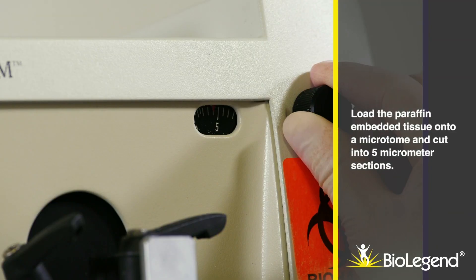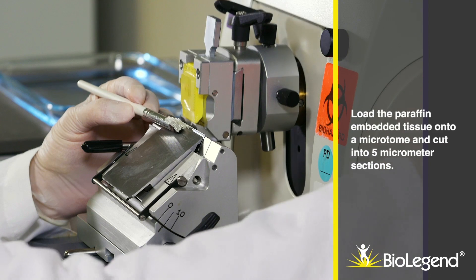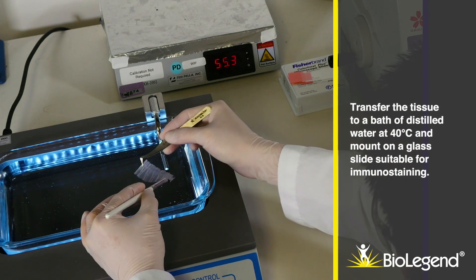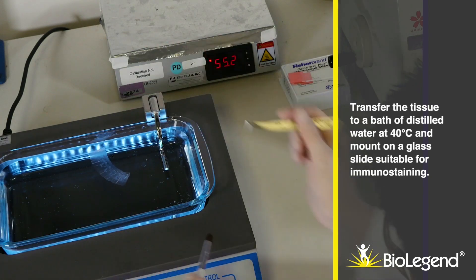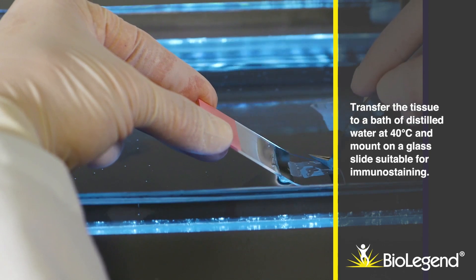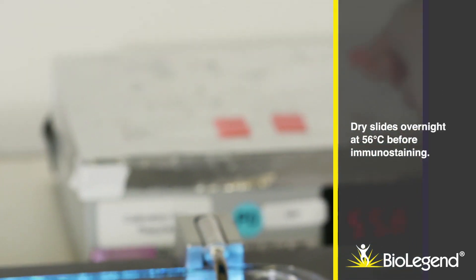Load the paraffin embedded tissue onto a microtome and cut into 5 micrometer sections. Transfer the tissue to a bath of distilled water at 40 degrees Celsius and mount on a glass slide suitable for immunostaining. Dry slides overnight at 56 degrees Celsius.